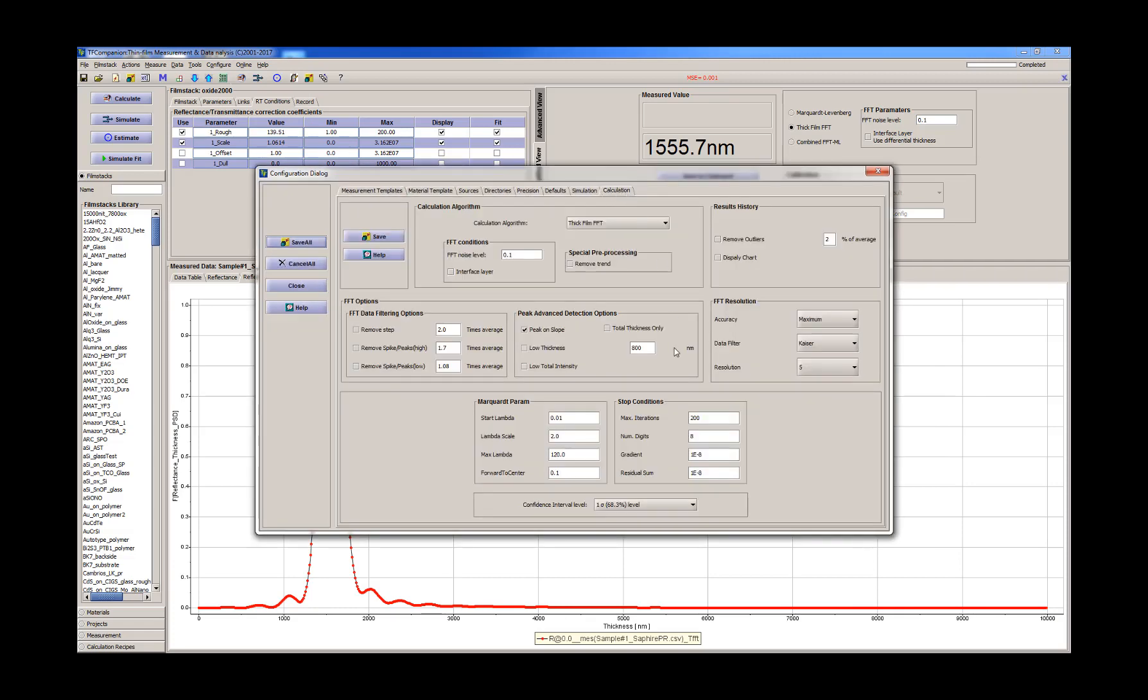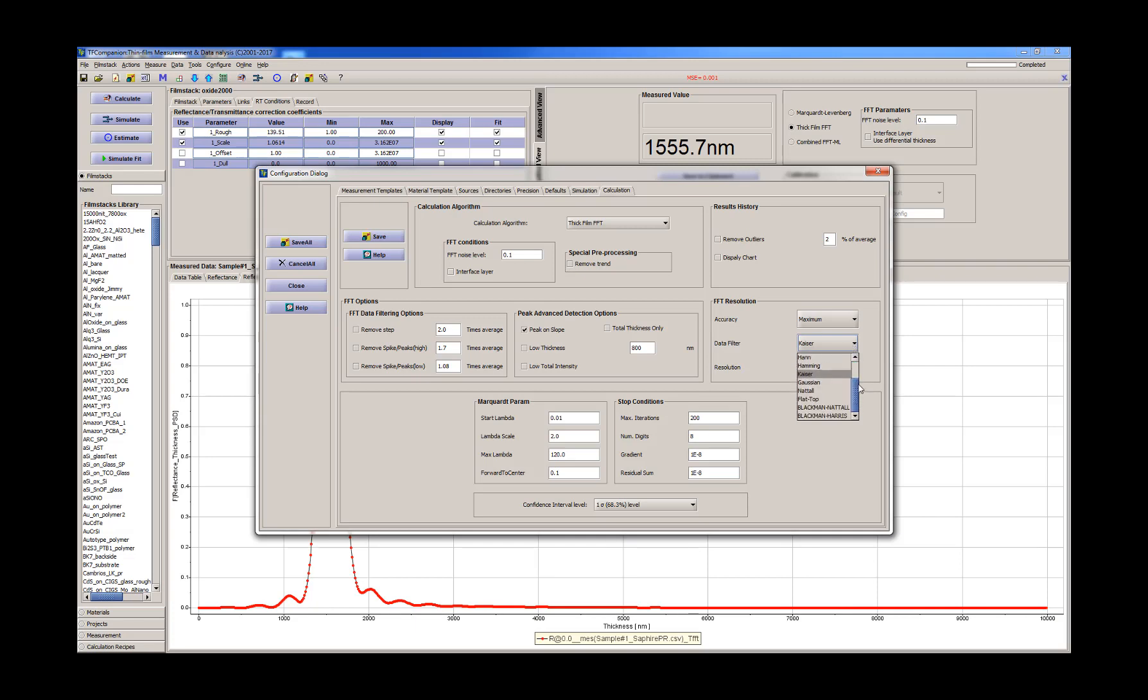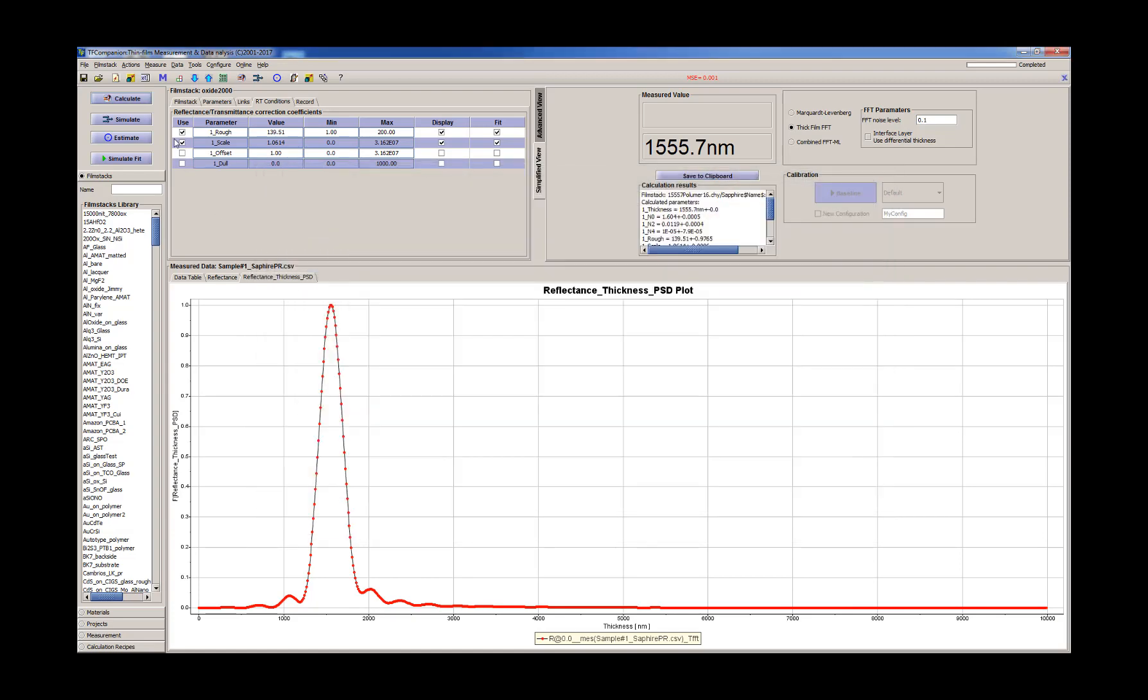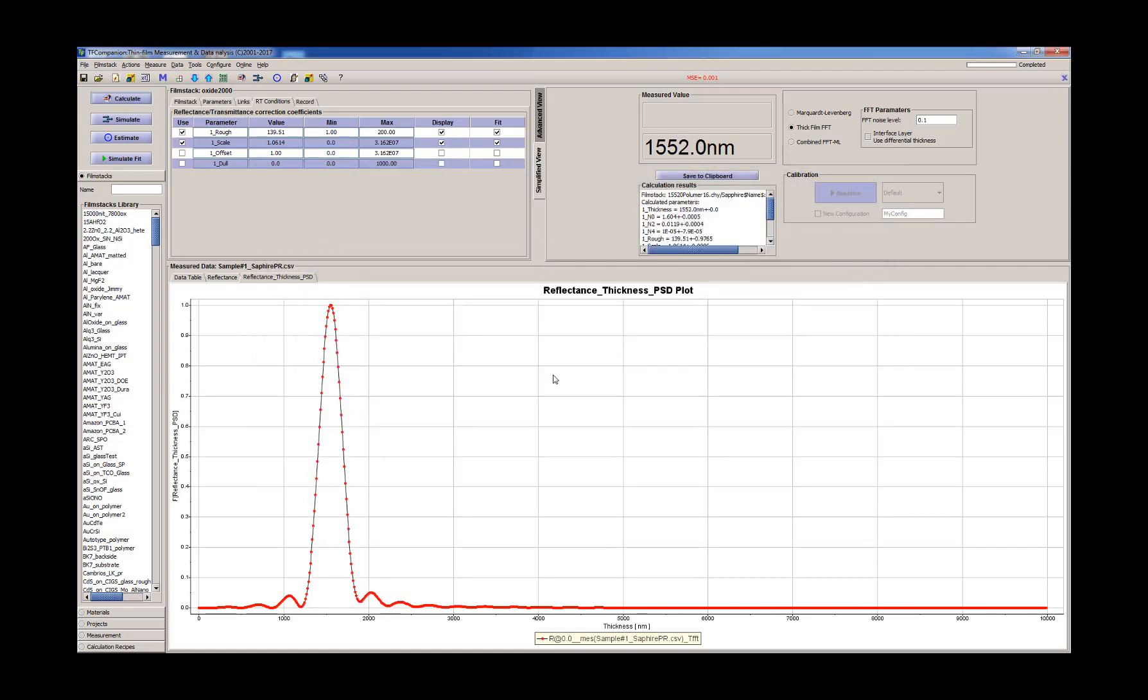So we need to adjust a little bit the parameters of the calculation. We have here Kaiser. Let's say if we have Gaussian. So this is a data filter, basically an apodization of the measured data. So it decreased, but we still have about 2 nanometers difference.